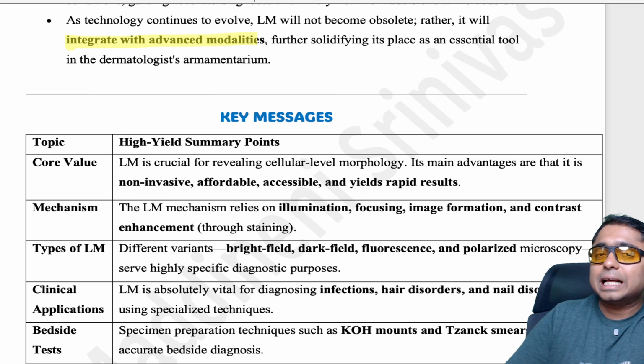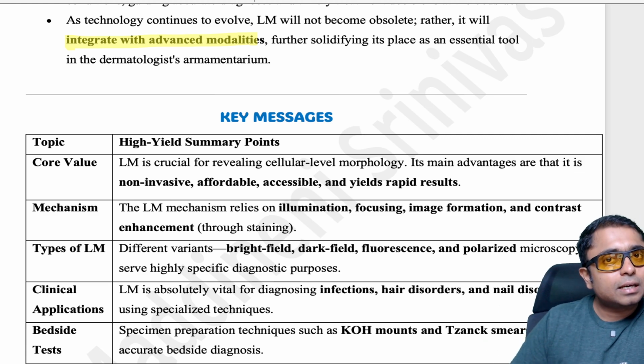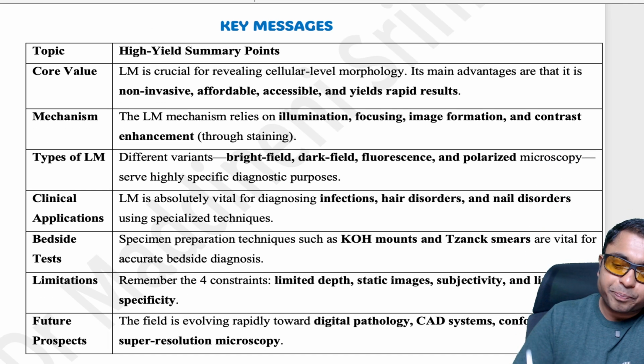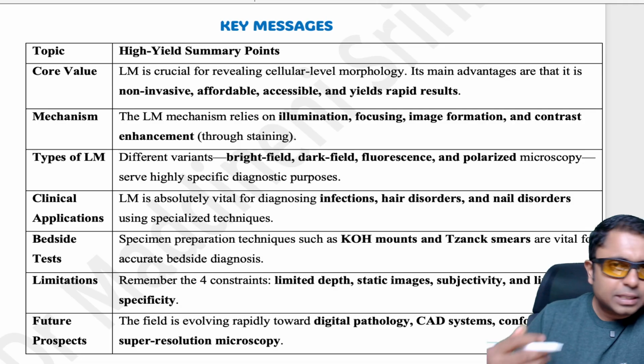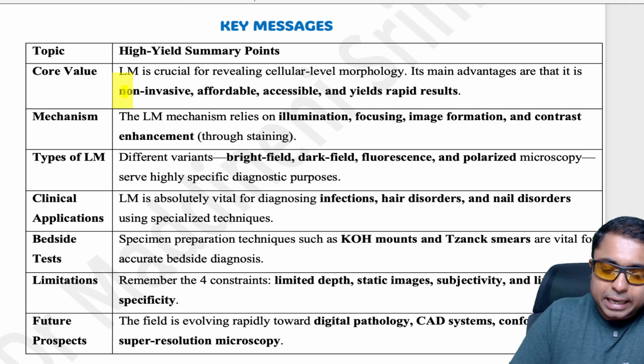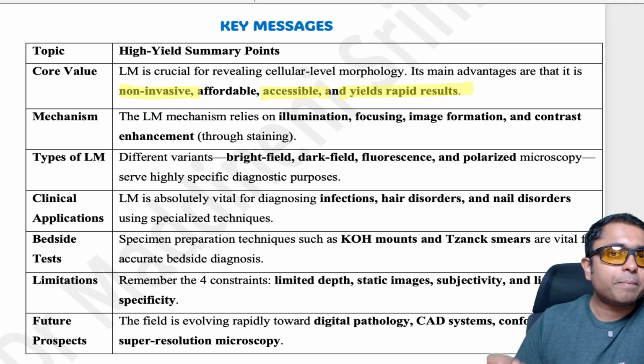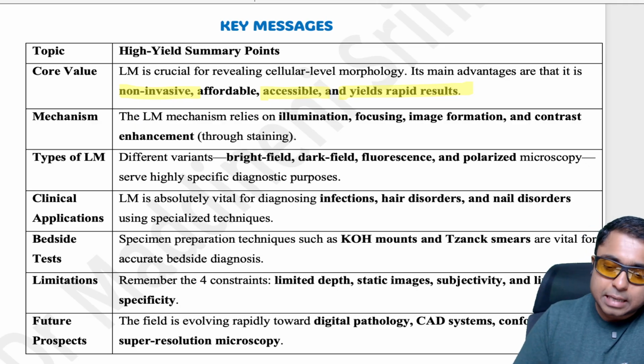We need not see the advancements as a threat to light microscopy. It is going to stay in the department. Even NMC is asking for the department to have one light microscope of its own, right? So again, to summarize the video very quickly, it is non-invasive, affordable, accessible, and it yields very rapid results. Turnaround time is very less.